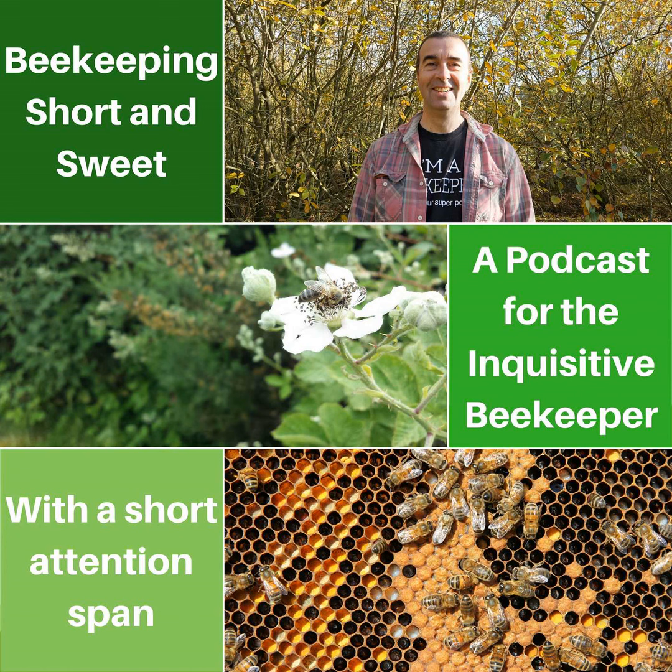And microscopes tend to take, as I've found, a bit of a back seat. And beekeepers do sometimes concern themselves about the cost of microscopy and think that it's prohibitively expensive for them to get started, but that's not the case, is it? No, it's not prohibitively expensive, and to be honest, I suppose you can't replace good husbandry as a beekeeper, but if you do have microscopes, then that can add significantly to the enjoyment of the interest, and also it can provide essential information as to whether you've got nosema infection or acarine problems or whatever.